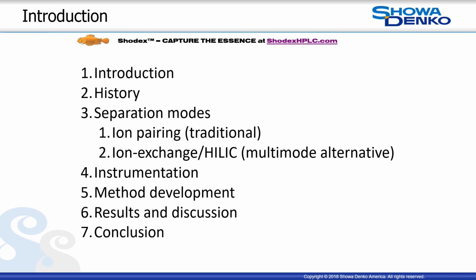In our presentation, we'll briefly discuss the history of PFAS, the separation modes, including ion pairing, and ion exchange HILIC as a multi-mode alternative, instrumentation used in our method development, the method development itself, results and discussion, and some concluding remarks.